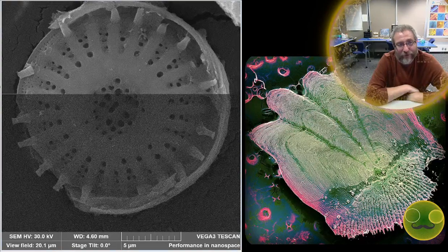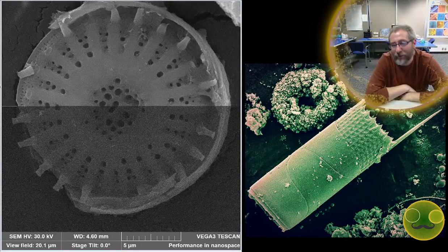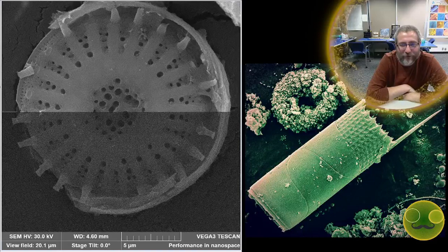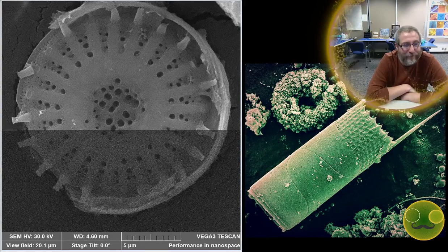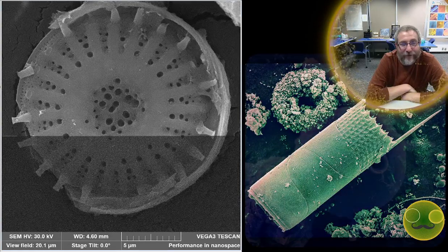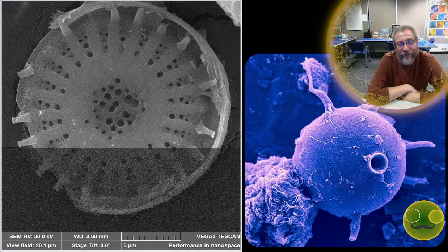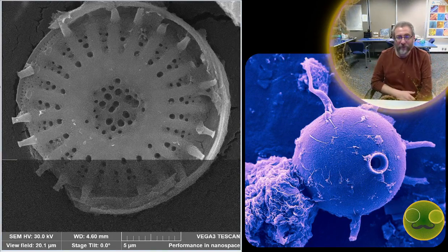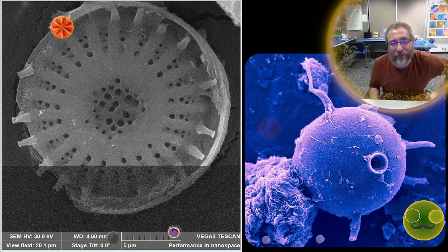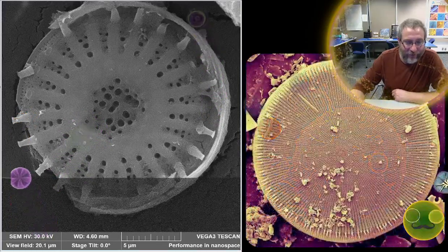so that they're conductive. And of course, the entire time things are under the beam, electrons are being blasted out of them. So I think that would be kind of cruel to put living organisms in there and have them basically attacked by tiny lasers that are ripping pieces of electrons out of their body. And another thing that's really critical is, see how long it takes me to take a picture? So if I'm scanning an image and it takes 3 minutes and I had something living in there, I wouldn't be able to image it very well. So all those things are problems that make it so that we can't usually use a scanning electron microscope to look at something that is currently alive.